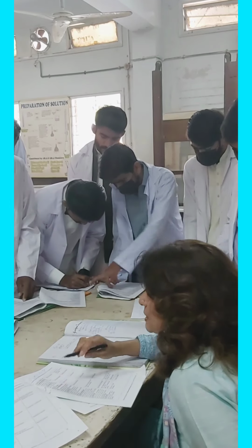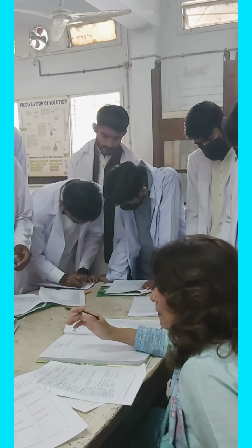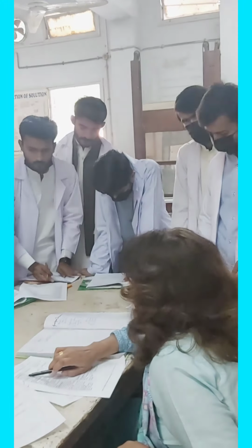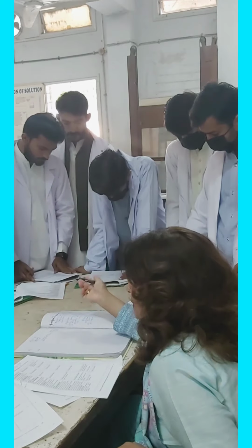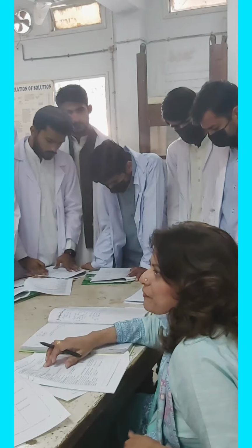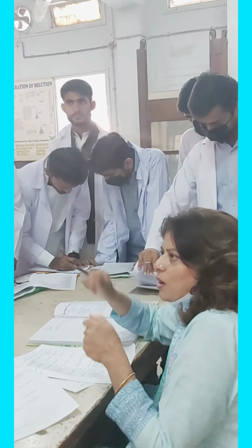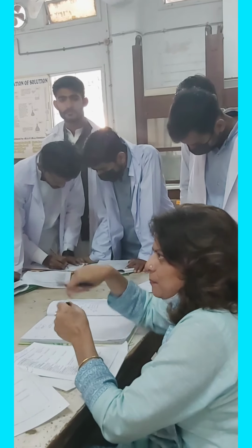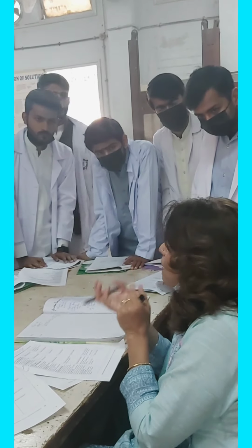So what is this test? Take a very small amount of your compound, your organic compound, in a dry test tube or watch glass, and then add 5 to 6 drops of sodium bicarbonate solution. Now effervescence will occur. What is effervescence? Evolution of gas, just like when you open a Sprite or soda bottle, or mix surf inside water, you feel it. That is evolution of gas.